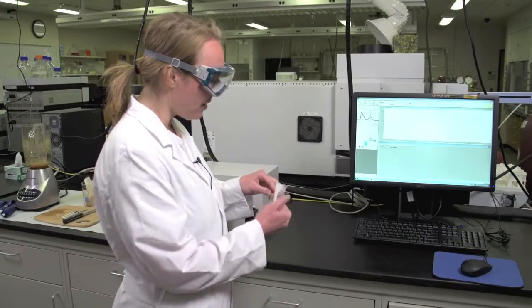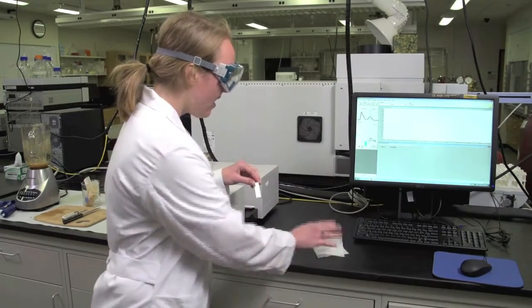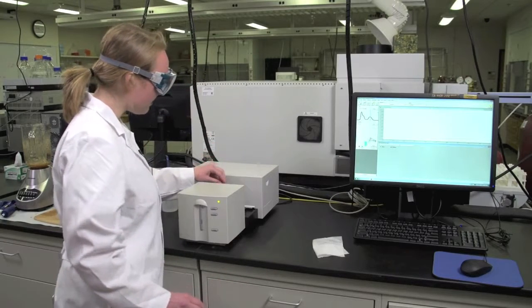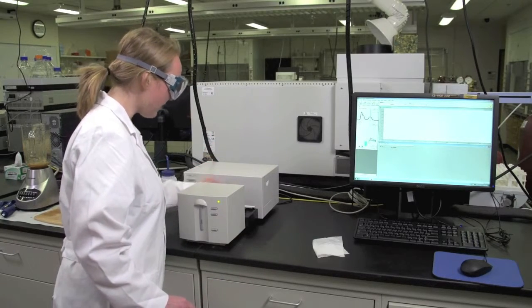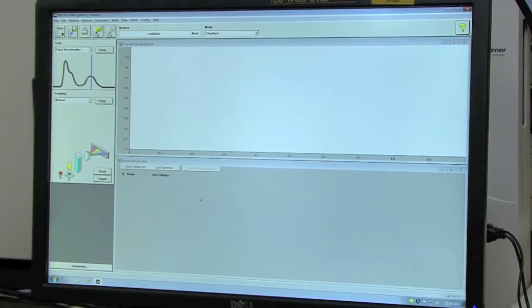Fill the cuvette with DI water and wipe the outsides with a Kimwipe to remove all fingerprints and oils. Place it inside the sample compartment chamber and press the arm down to lock it into place. To collect the blank spectrum, click on the Blank button.